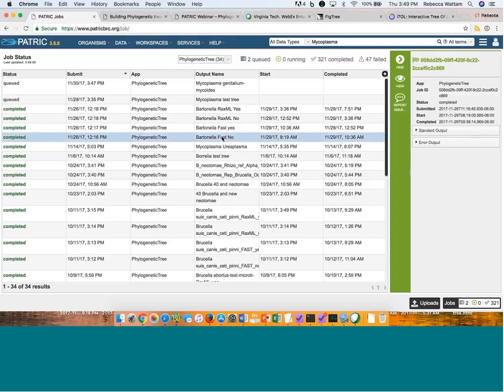Well, you can click on it, and notice that once I click on it, it highlights some things in the green bar that allows me to look at it more carefully. I can view the job, or I can report an issue. If I had a failure on a job, I would click on this.